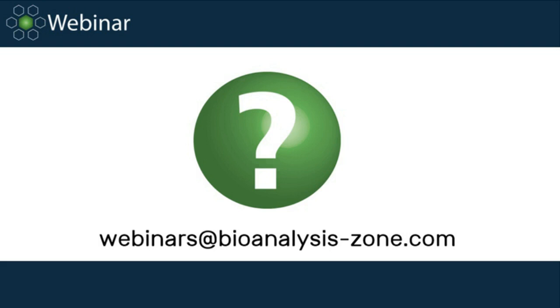Well, till now we validated 9 methods, and in one of them we have up to 2 years stability. For the methods that we have done samples and have done ISR, we haven't had any issues. This could be part of our technique, which is called impact-assisted extraction, which you can read about in posters, publications, there's information in the public domain.